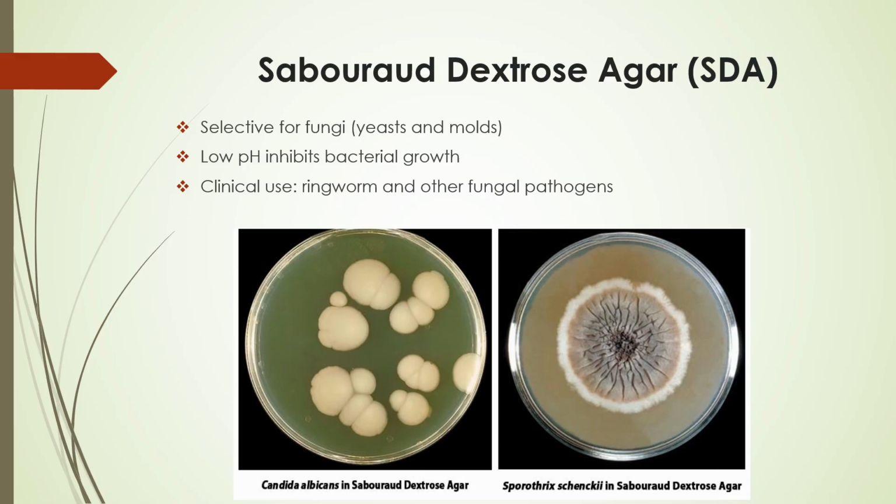When it comes to cultivating clinical fungal pathogens, such as those that cause ringworm and other skin infections, SDA is especially helpful. Peptones and dextrose are among its constituents, which offer nutrients specifically designed for fungal metabolism.